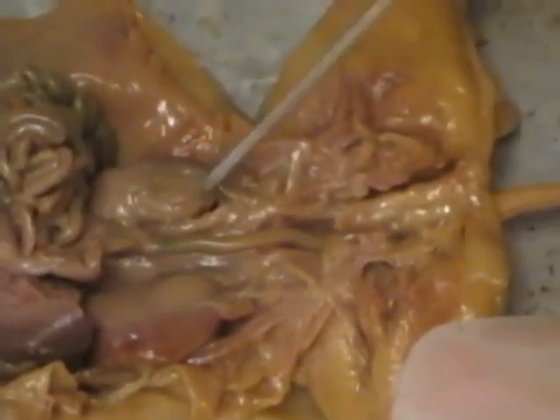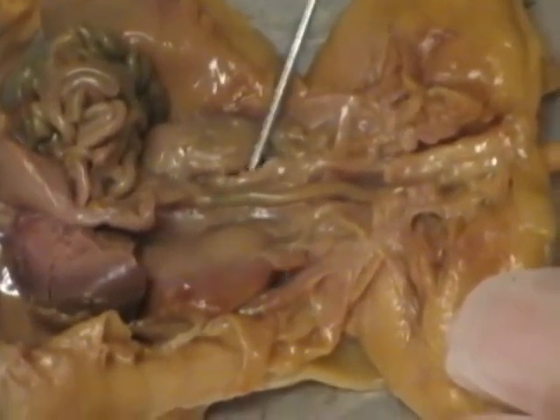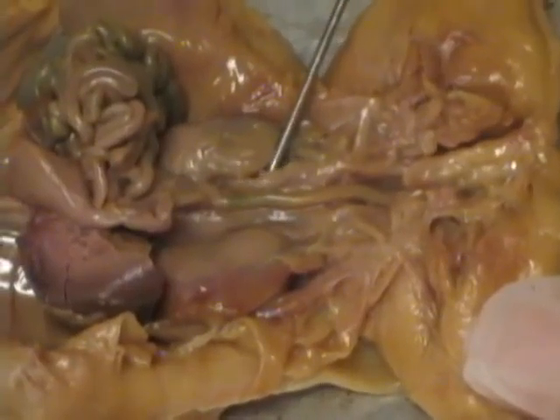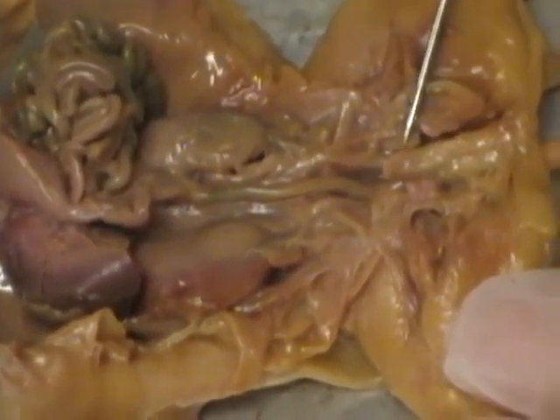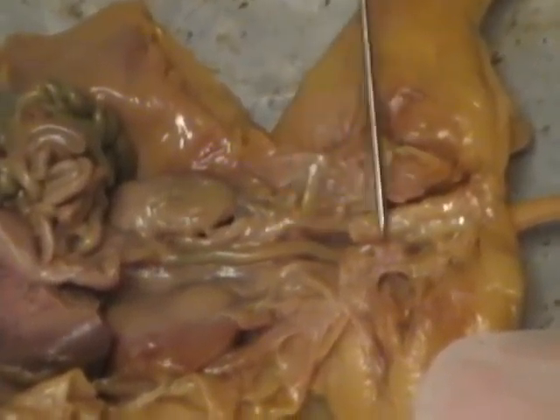Right there. And then, so right here is a ureter. And this goes through the bladder, which we cannot see. It would be right here, but it's been cut out, and we don't know where it is.